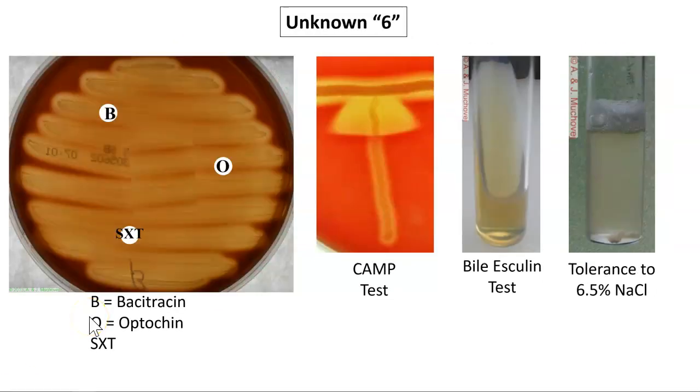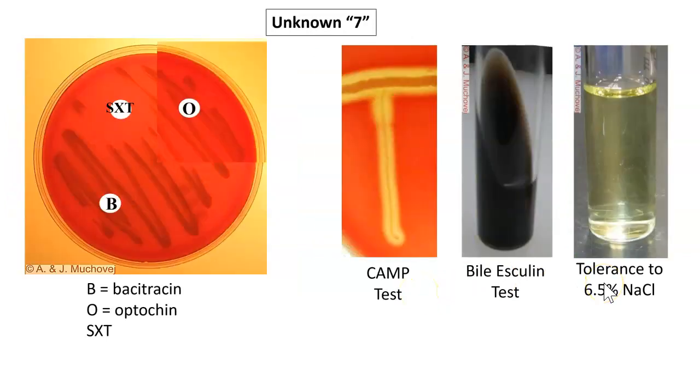The first of the other 2 tests we have to perform is growth on 6.5% NaCl broth. The broth has about twice the salinity of seawater, making it a hypertonic solution. Most organisms cannot grow in this high concentration of salt. Growth is demonstrated by a cloudiness or turbidity to the medium, which is a positive result. This means positive for salt tolerance. No growth looks like this one, a clear, see-through broth, and is a negative result.